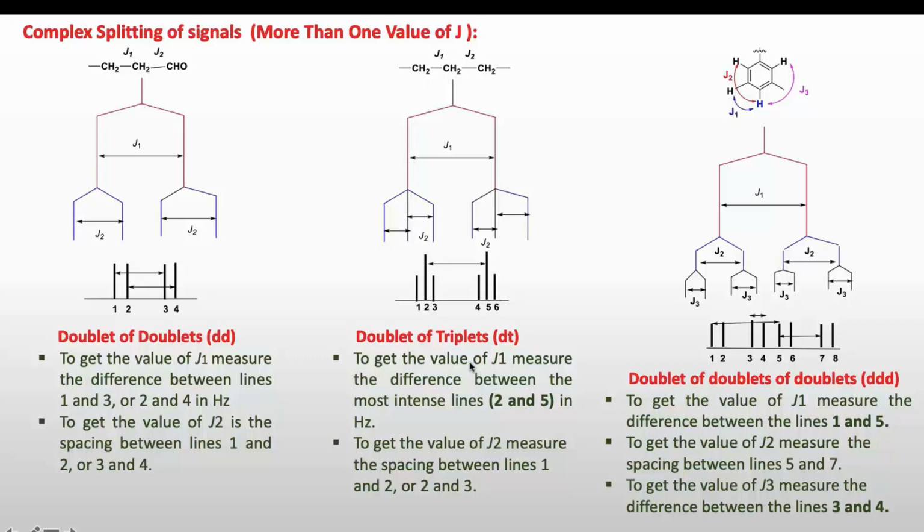This is an example of a substituted benzene. So if we see the coupling pattern, this proton has this proton at a 3-bond distance. So this will give the highest coupling in magnitude, and these two protons will give the meta coupling, because they are at a 4-bond distance.